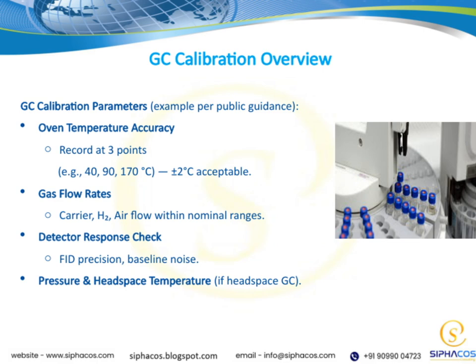Next, we look at gas flow rates. It's important that the carrier gas, hydrogen, and air flows stay within their nominal ranges. Proper flow rates are essential for optimal separation and detection.